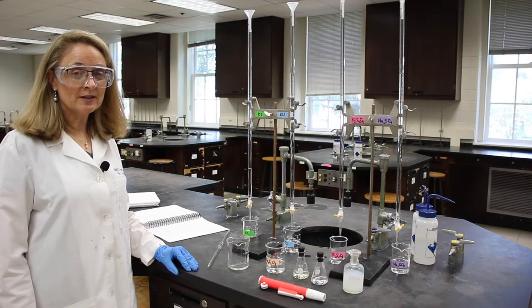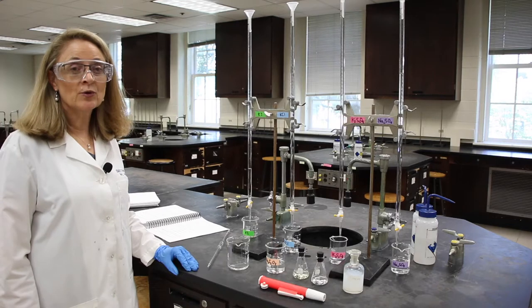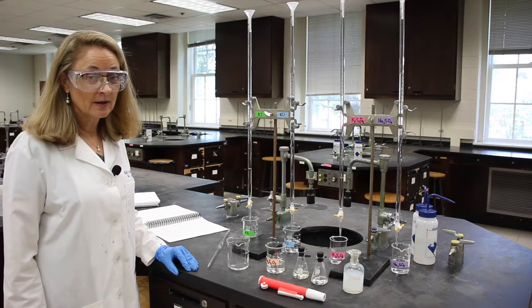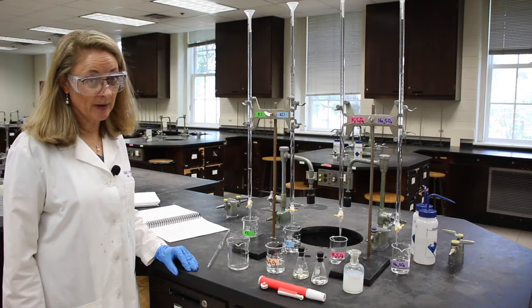Hello, and welcome to lab. Today, we're going to do the rate law of a chemical reaction. I'd like you to be my lab partner, and I'd like you to follow along in your lab manual.